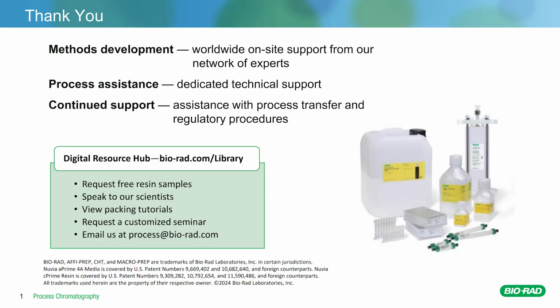Okay, great. And as a reminder to our audience, you can go ahead and type in your questions for Heidi now. So our first question is, why should we be concerned with endotoxin when dealing with mammalian cell productions?